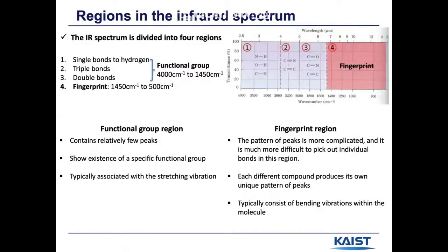The typical IR absorption range for covalent bonds is 4000 to 600 per centimeter. The graph shows the regions of the spectrum where the following types of bonds normally absorb. For example, a sharp band around 2400 to 2200 per centimeter would indicate the possible presence of a CN or CC triple bond.